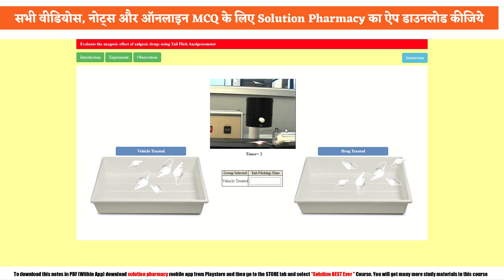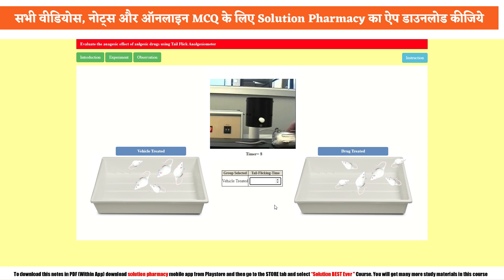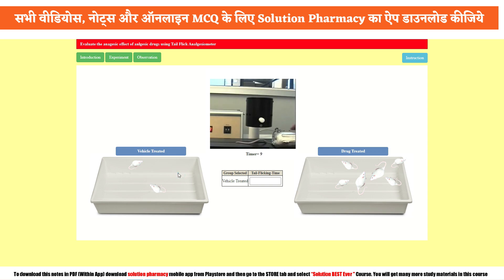Starting with the vehicle treated group, we place one animal below the heat-providing light source and note at which time the rat starts flicking its tail — that is our response time. The first animal's response time is 8 seconds. Continuing with the remaining vehicle treated animals, the recorded response times are: 13 seconds, 13 seconds, 9 seconds, 14 seconds, and 10 seconds. Note: there was a minor software bug so we recorded the time shown on screen. We are now done with the vehicle treated group.